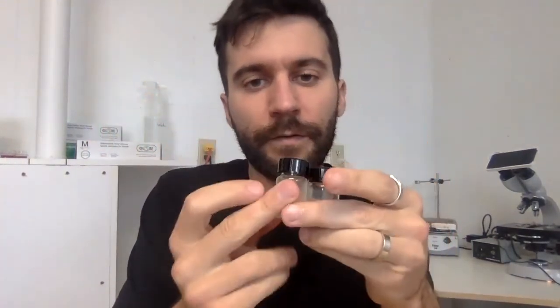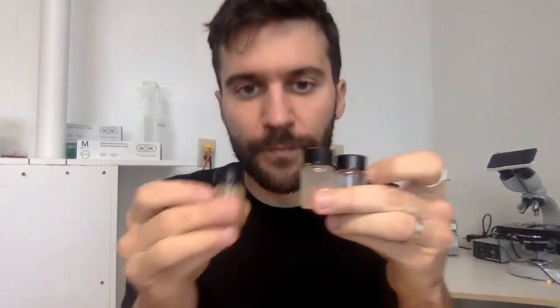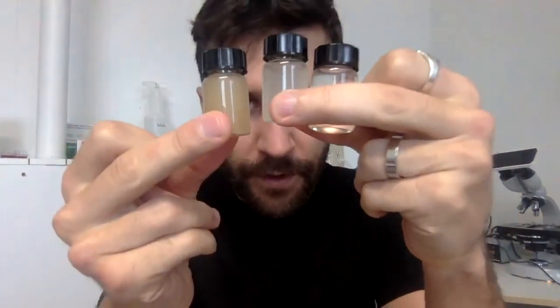Okay, so let's cap these again. We can see the progression of dilutions. Obviously, this is not a surprise, they're getting more diluted.